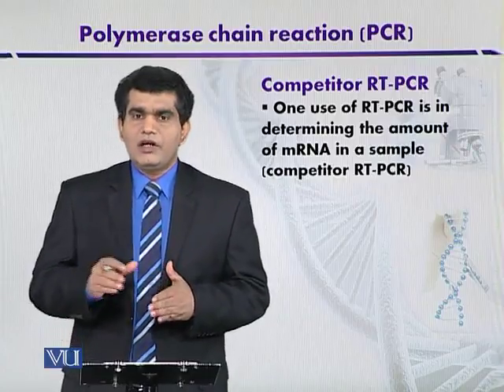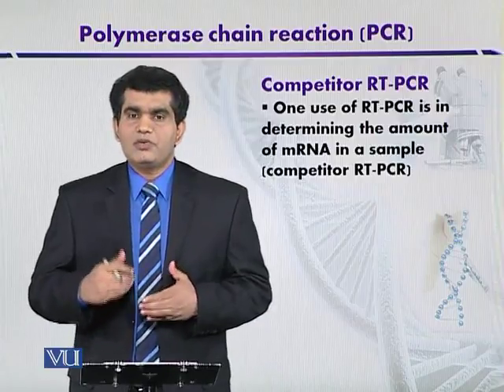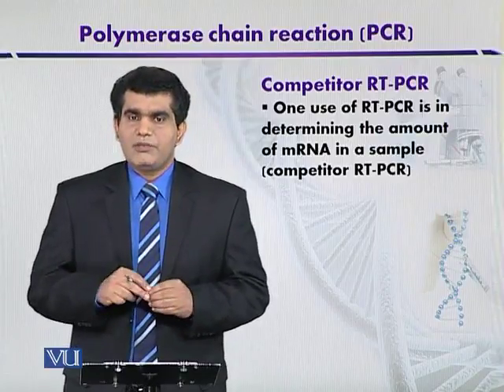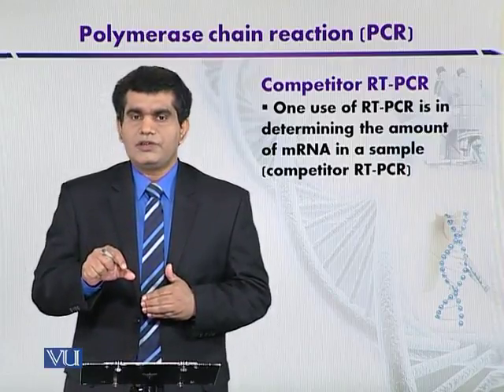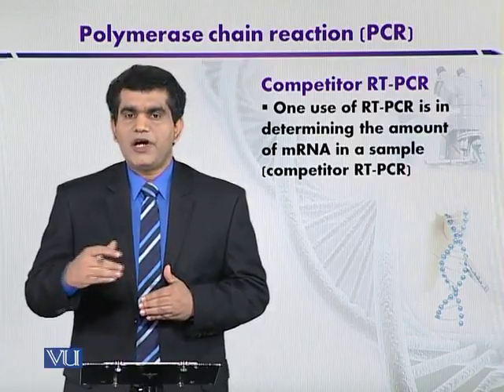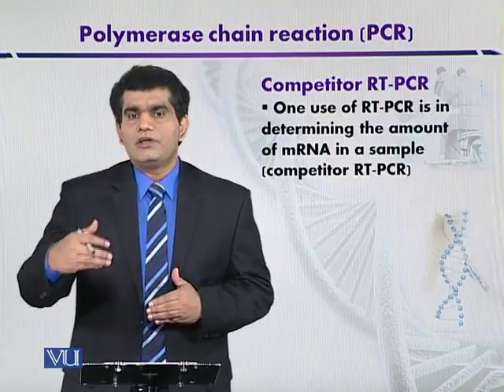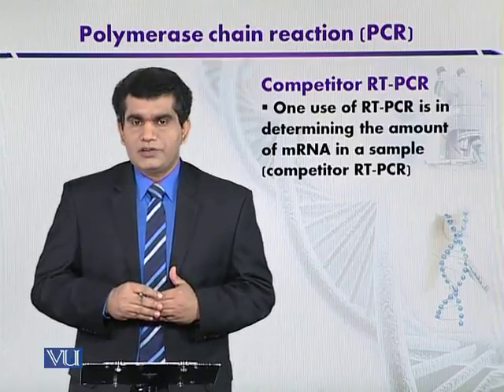So we can again come to our main discussion: how can this competitor RNA be used in the quantification process? We now have the idea that it is a laboratory-synthesized fragment. We can prepare known concentrations of the competitor RNA standard, and this process you can call spiking. स्पाइकिंग एक ऐसा प्रोसेस है जिसमें किसी चीज़ की जो कंसंट्रेशन है उसको शॉर्पली इंक्रीज कर दिया जाता है और इसको फिर एज ए स्टैंडर्ड यूज़ करते हैं पीसीआर रिएक्शन में.